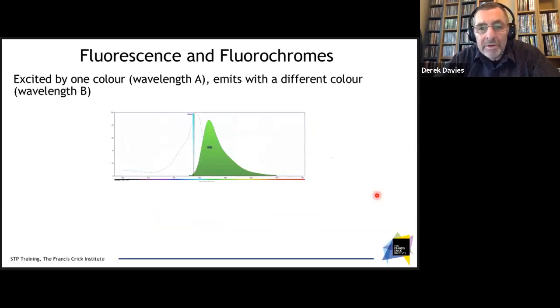So many of you will be familiar, or possibly even fed up with seeing this histogram, this plot here. This is the excitation spectrum and the emission spectrum of fluorescein, FITC. And we know that we can optimally excite it at 488 nanometers, and this is its emission wavelength. But remember, we don't collect all the photons on a traditional flow cytometer, we just collect a portion of them, and that is defined by the optical filter that we have in there. So generally something like a 530/30 filter to allow us to capture the maximum emission of fluorescein.